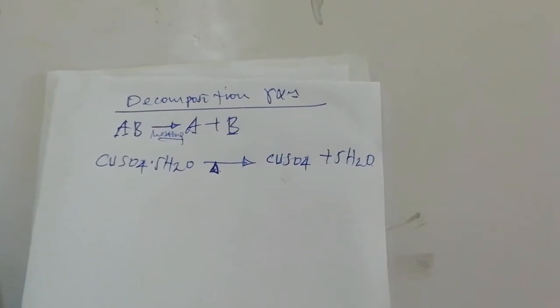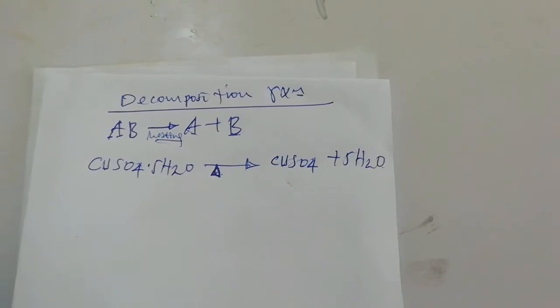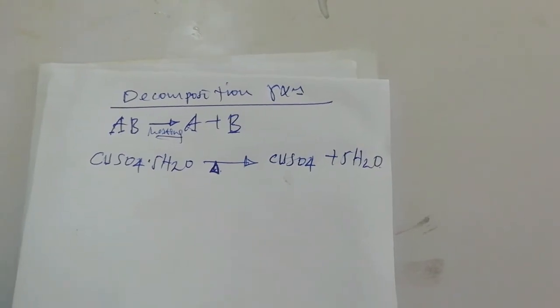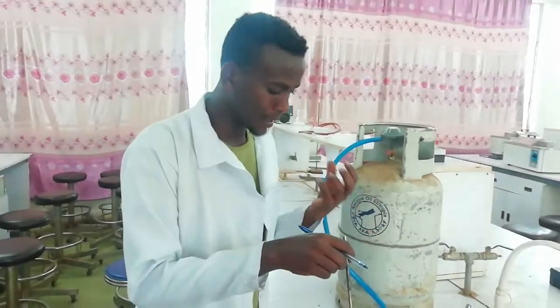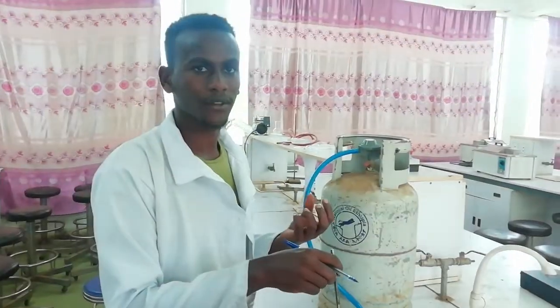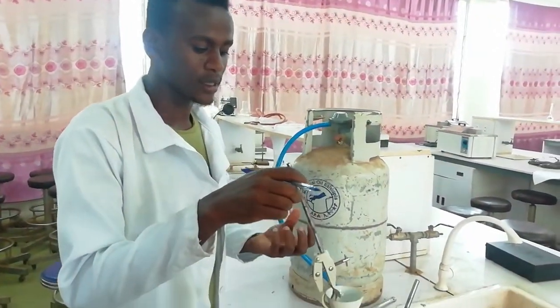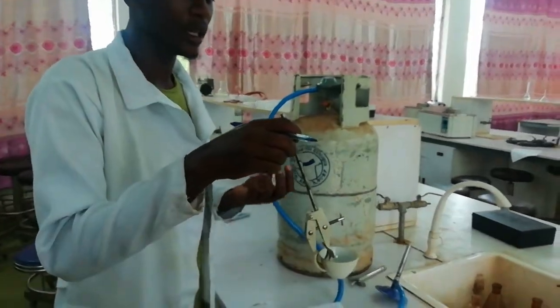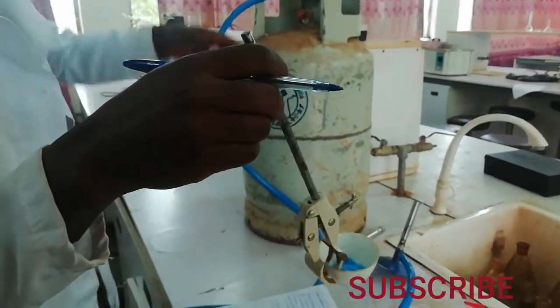After it loses its water, when we add water dropwise, it turns back into a blue color, which is copper sulfate pentahydrate. Now let us heat this copper sulfate pentahydrate to get copper sulfate.